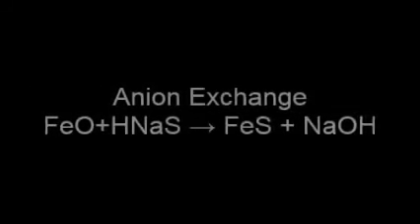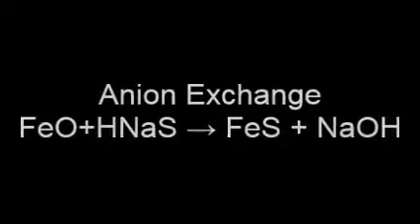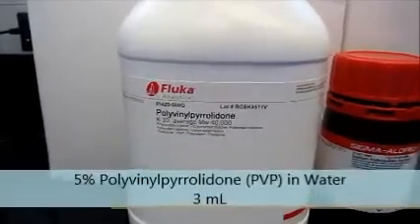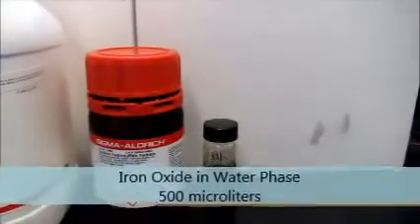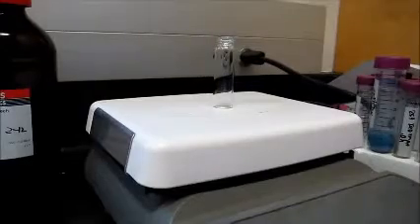The anion exchange reaction is iron oxide reacting with sodium hydrosulfide to form sodium hydroxide and iron sulfide. For anion exchange, the materials needed are PVP, sodium hydrosulfide, and iron oxide in water phase. This experiment is run in a vial equipped with a stir bar.